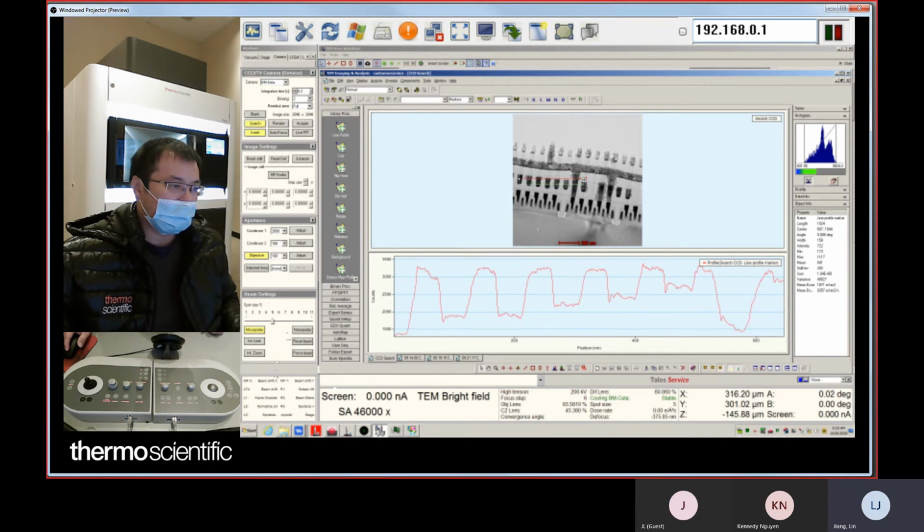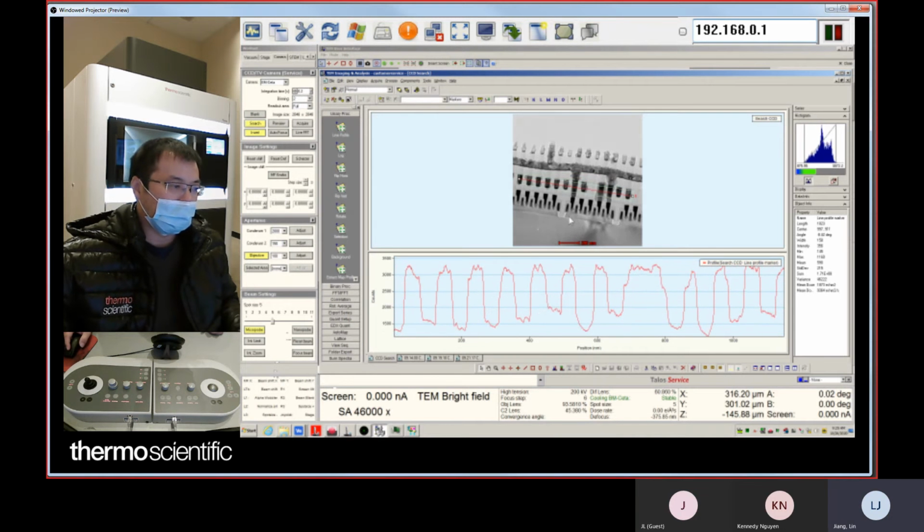To increase count, you need more exposure time. And then you can take an image. You can just acquire. Right now it's 0.2 seconds. Oh, sorry, my bad. Because just now I changed the intensity, the counts will change a little bit.